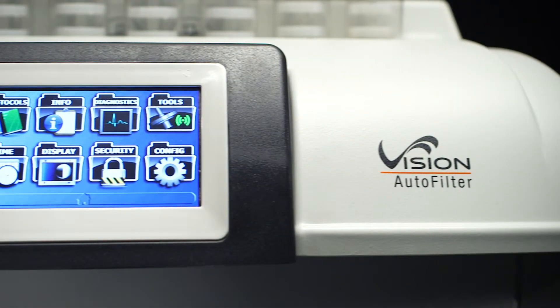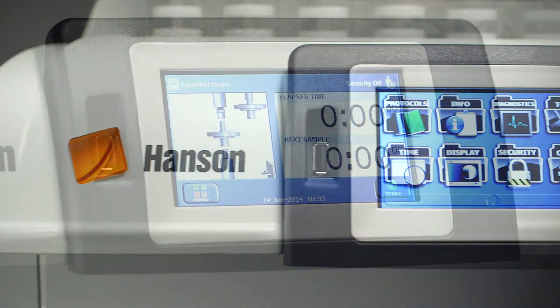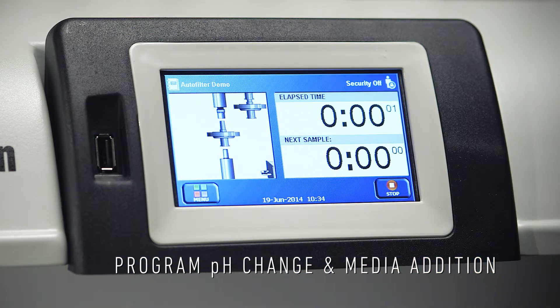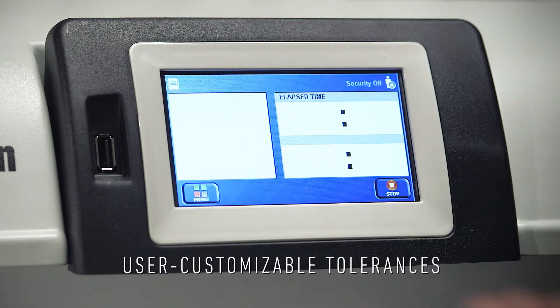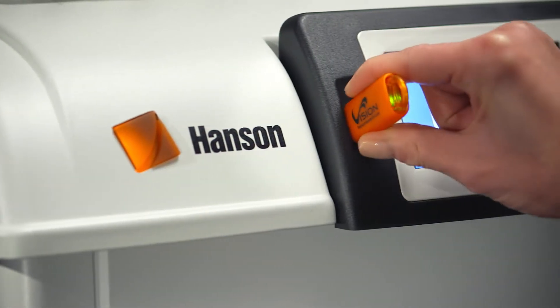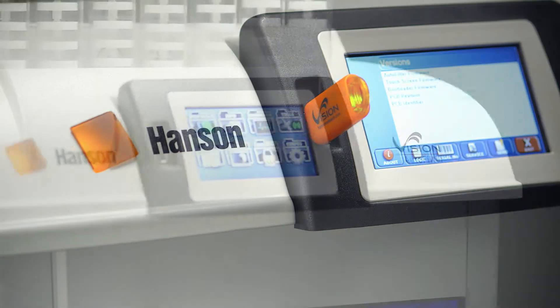The Vision Auto Filter Changer is enhanced with powerful Vision G2 software, making dissolution runs fully customizable with up to 100 unique methods. You can program temporary pauses for pH change and media addition, and customize tolerances to alert if anything drifts.